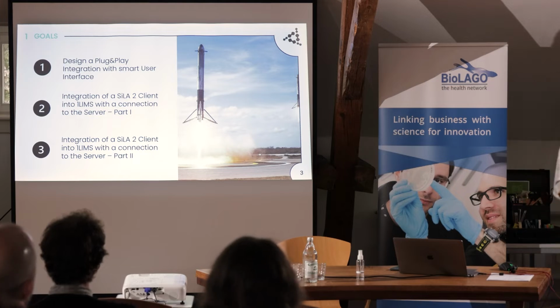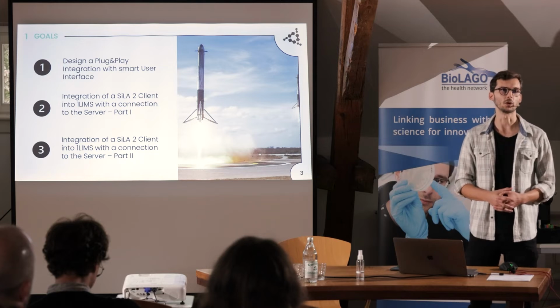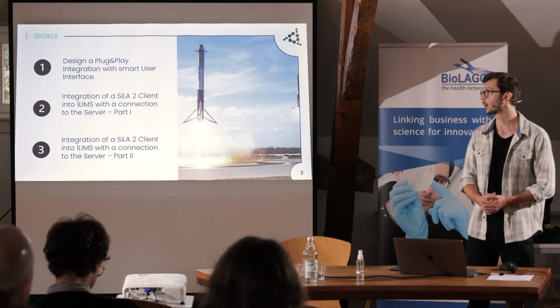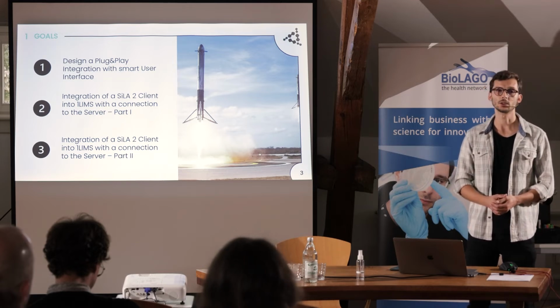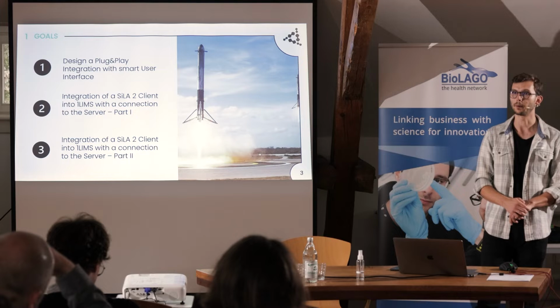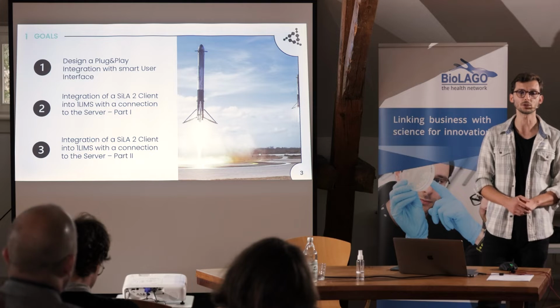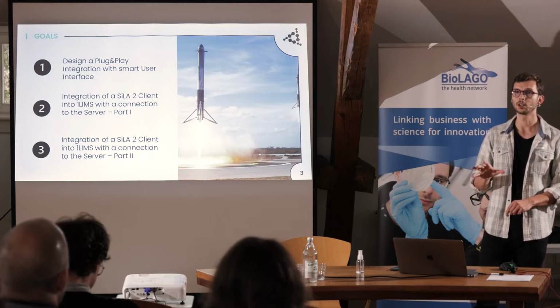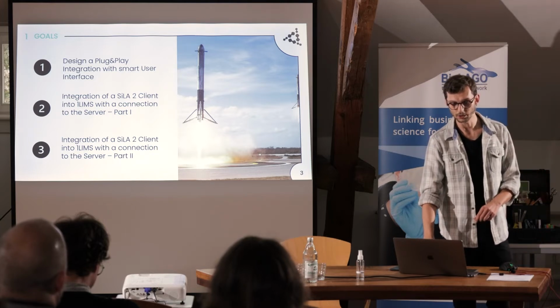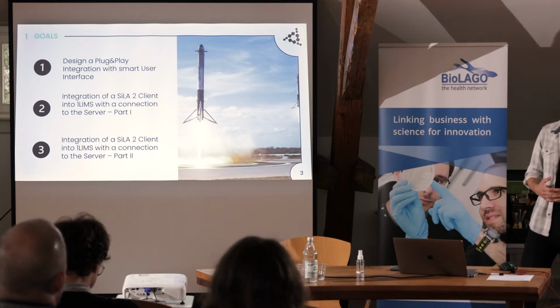First of all, the goal of the first hackathon was to design, just theoretically, what is needed for connectivity between a LIMS system, which we supply and which is hosted in the cloud, and a device in the laboratory. The second goal was, from the LIMS perspective, to prepare the functionality based on the LIMS system: what is needed for the LIMS supplier to have a generic integration to other devices. And the third goal, in the third hackathon, was to look at the SiLA standards on both sides and combine these 2 topics together.